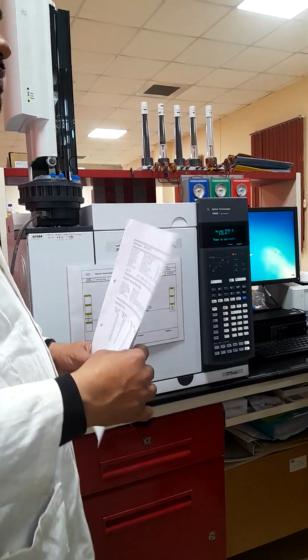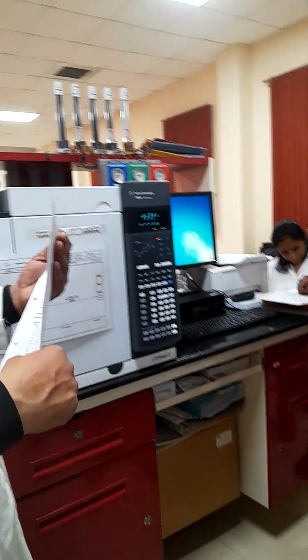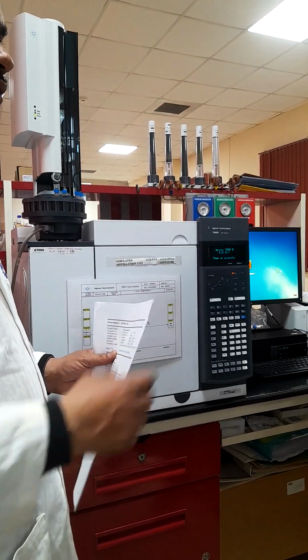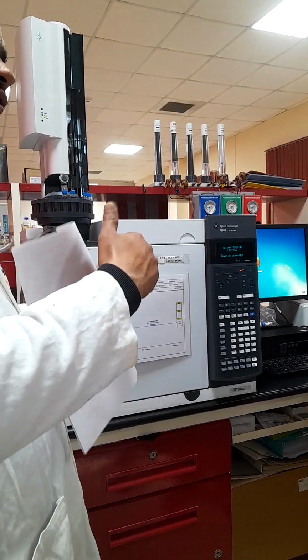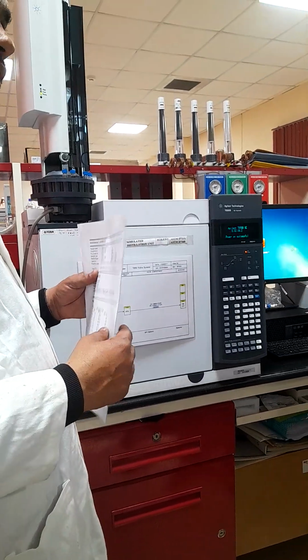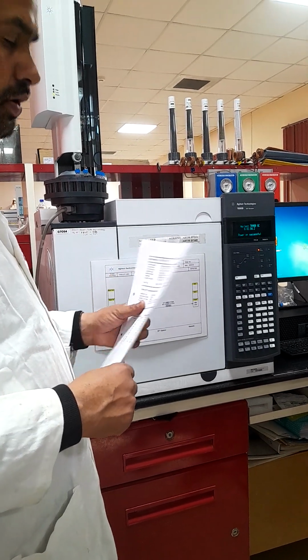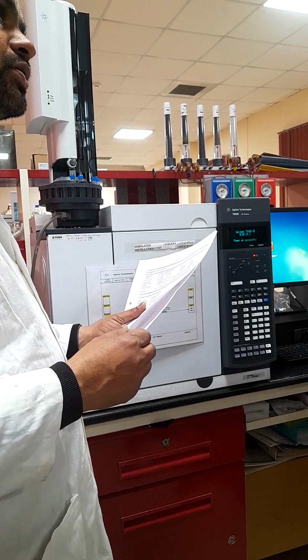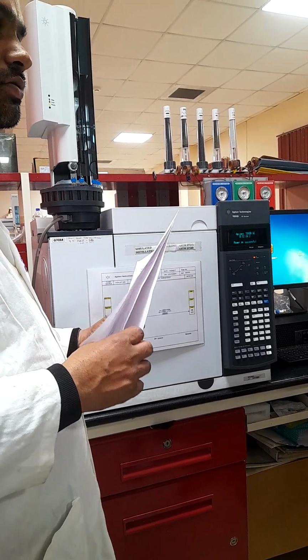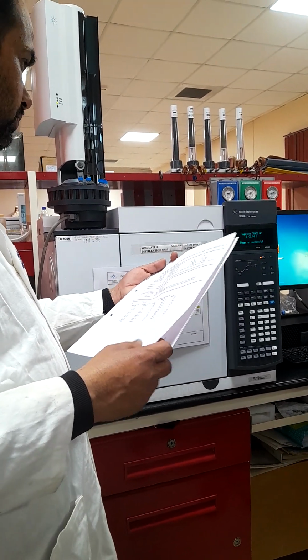Why are you calling it zero air? It has very few impurities of nitrogen and other impure gases. You cannot compare it with simple air; it has a specified purity of 99.9%. That means it is cleaner than normal air, because in air we get mixtures of gases, na? Carbon dioxide, anything can be there. Helium is 100%.